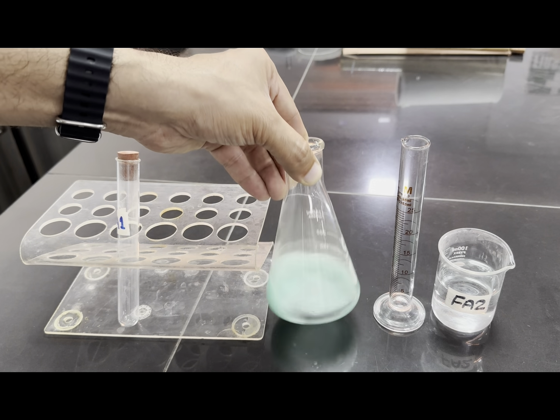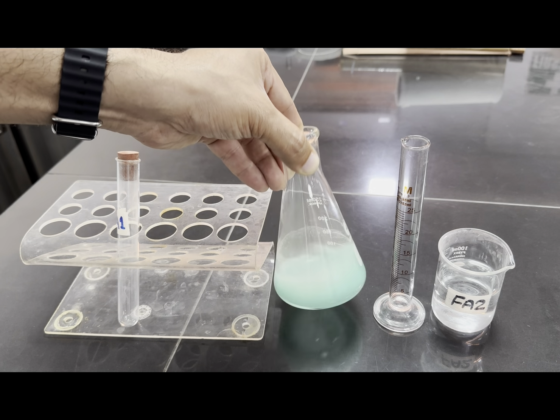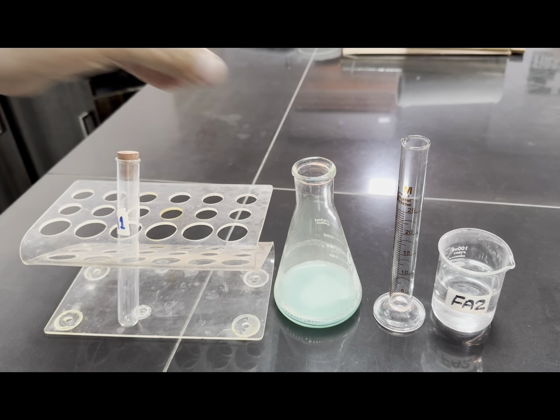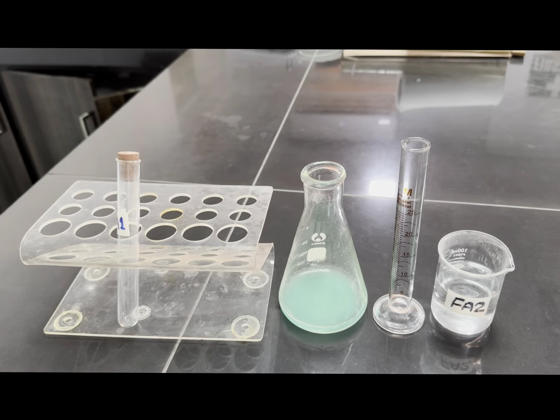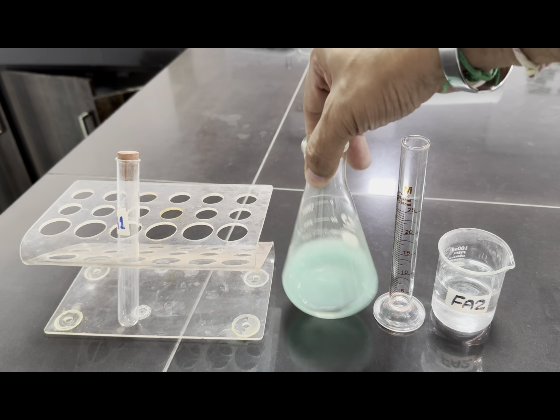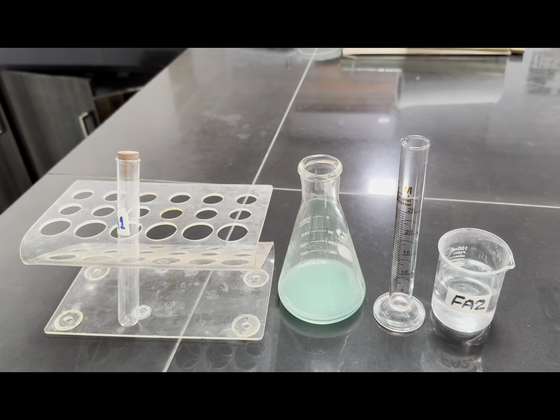Swirl the flask and leave the flask to stand for some time so that the reaction gets completed and all of the carbon dioxide gets evolved. It has taken approximately 3 minutes to get this reaction completed, and now there is no more fizzing happening. So the reaction is completed.